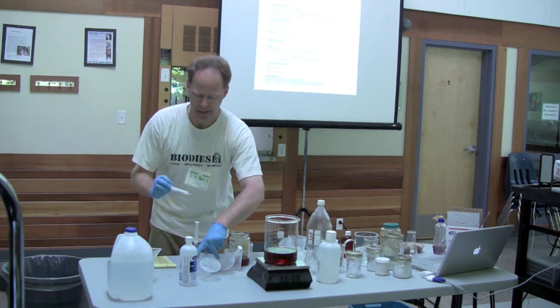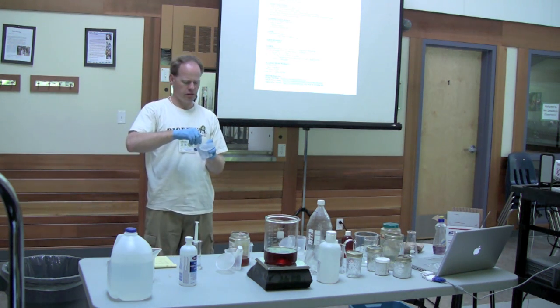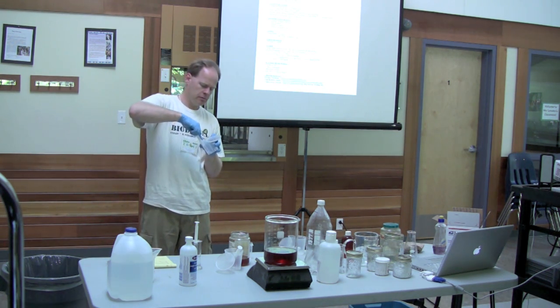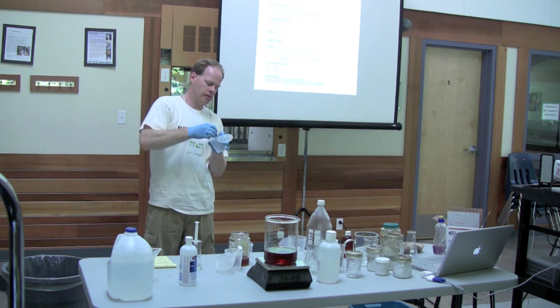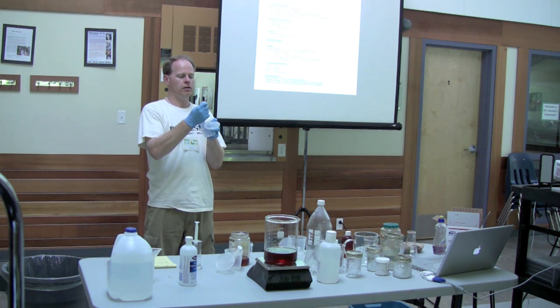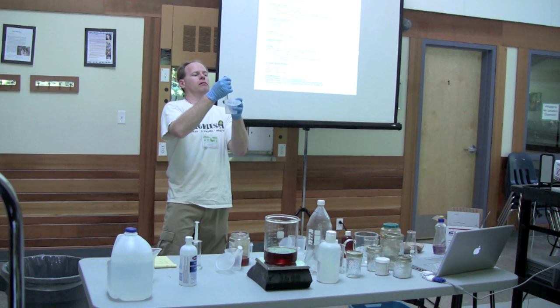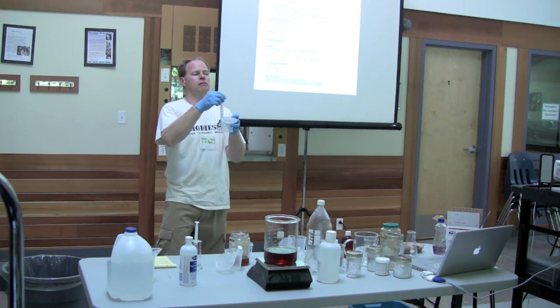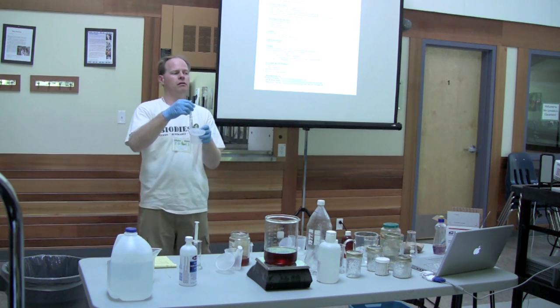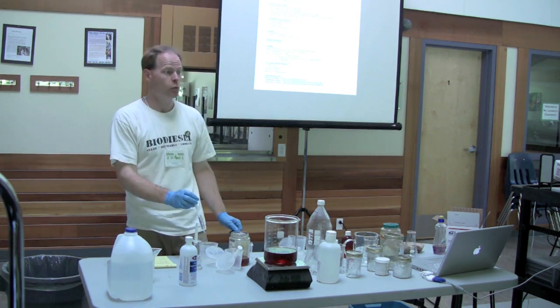Is one easier to clean than the other? Not really. No. They both do a really good job. I mean cleaning the glycerin, like out of a processor, or purifying the glycerin, taking out methanol. Purifying the biodiesel? I tend to think that sodium has more kick.